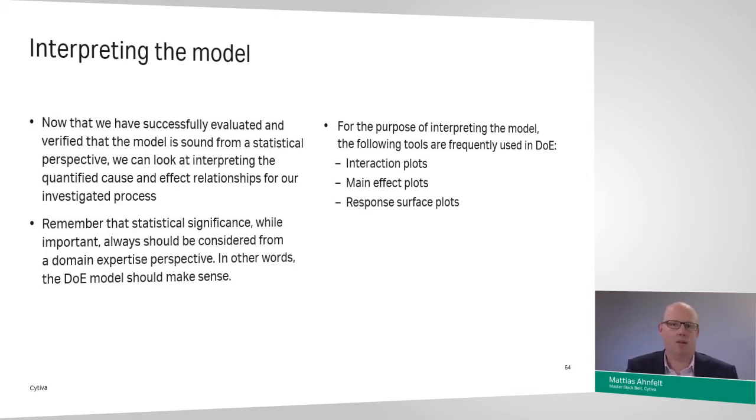It's important from process development in general that whatever conclusions we make are based on really significant data. However, of course, it also is an important aspect that the transfer function, the model, the conclusions that we make about the process we're developing are sound and make sense from a mechanistical perspective.